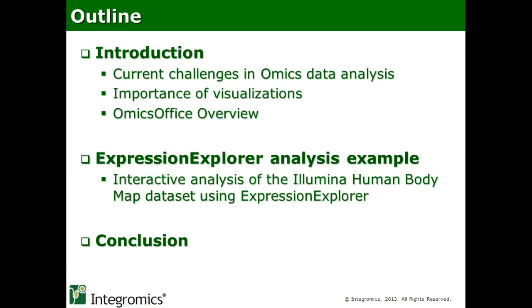After this, we will go into OmicsOffice and use the ExpressionExplorer, which is one of the elements of the OmicsOffice suite, in order to explore an analysis example using, in this case, some data from the Illumina Human BodyMap, which has been analyzed with a third-party software.